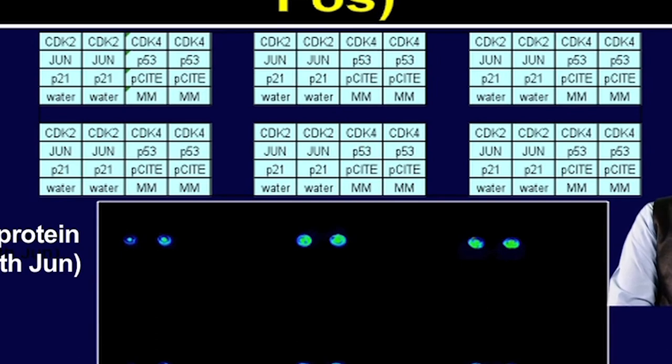Now, if we want to study the JUN and FOS protein interaction, you can use FOS as a query protein. It will bind to the JUN protein spot, and therefore two spots of JUN will light up as you can see in the slide. So, in all 6 blocks, there are duplicates of JUN proteins which are interacting with FOS protein, and so JUN FOS protein interactions can be established using the protein microarray system.